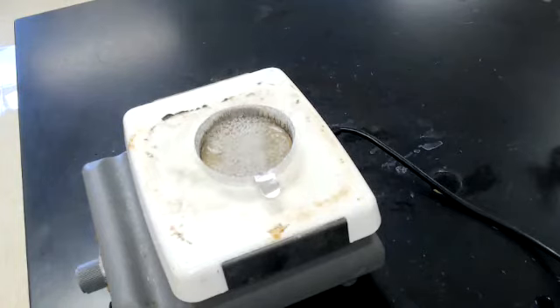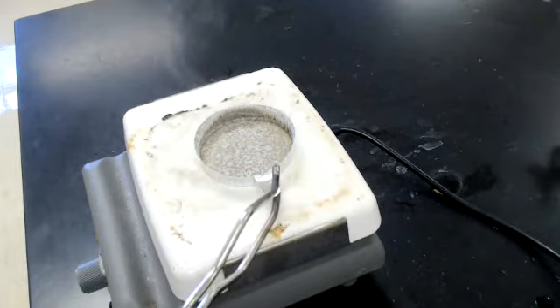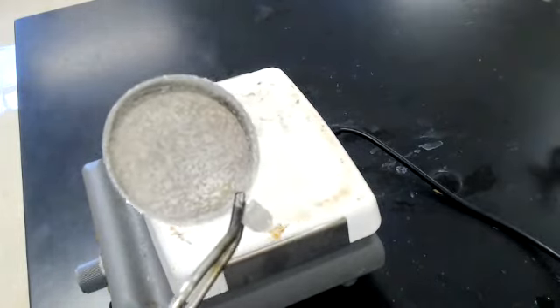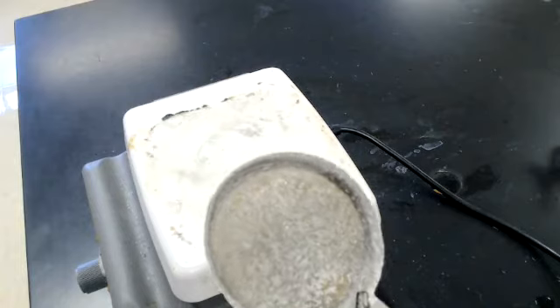And it's actually almost done. I hope you see there's very little water left in there. I also hope you see there's a color change coming on, and that's going to be important for you to know. Okay, since it's hot and the water's now gone, I'm going to pull it off. I'll let you see what it looks like here. Okay, you got a good look at it.